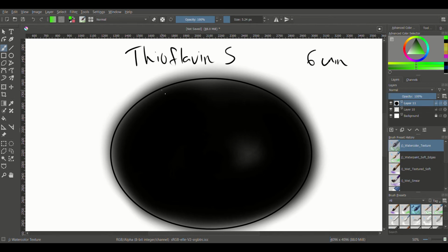And we're going to put the slides into acetic acid, wash that off, put them into alcohol for a couple changes, and then place them into the Thioflavin S, and that's going to be on a shaker for about 7 minutes. Now, of course, we're not going to see anything on the slide at this point. This is a fluorescent technique, so don't expect to see really anything on your actual section just by looking at it. But then we're going to rinse the slides with a couple of changes of 50% alcohol. We're going to keep the agitation up for this.